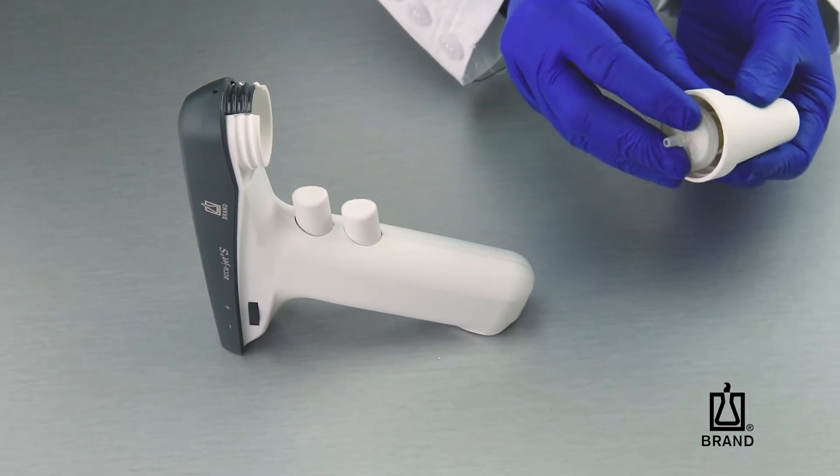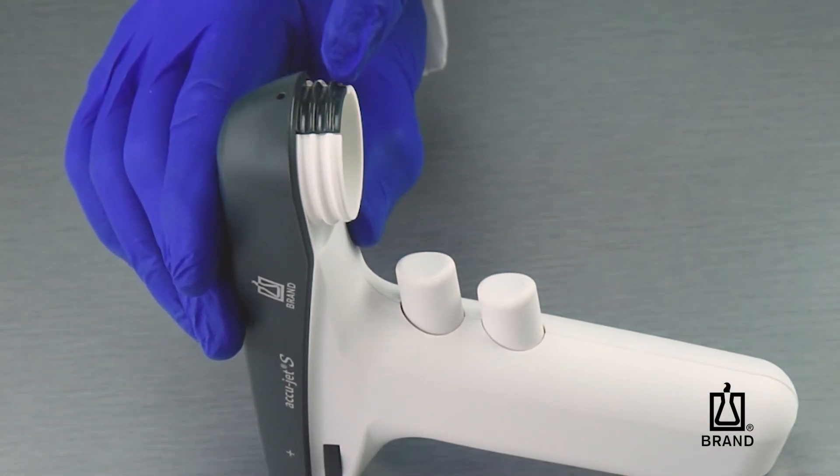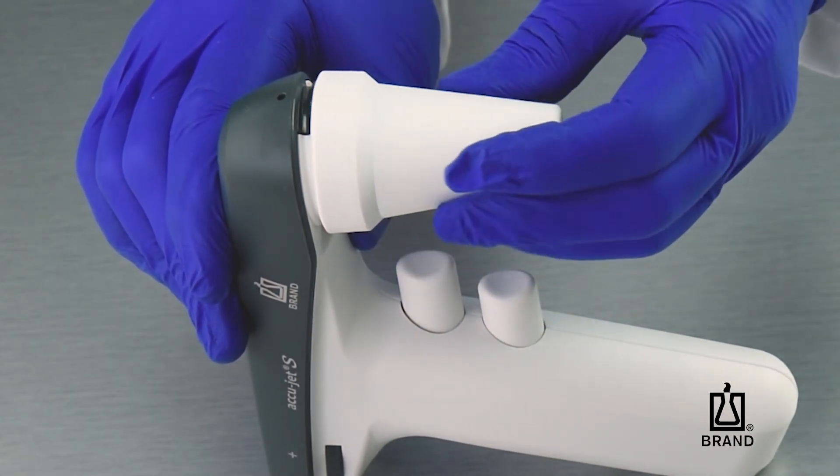With the new filter installed in the adapter, it's time to insert it back into the adapter housing. Press gently on the housing cover until the threads align, allowing the adapter to screw into place.